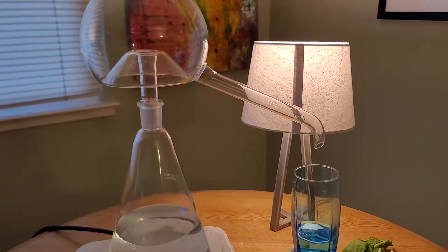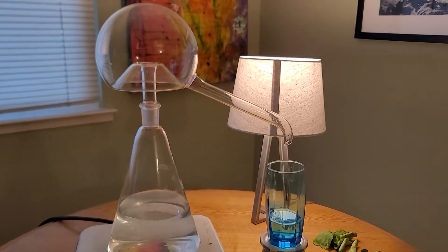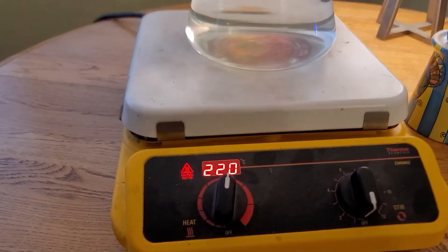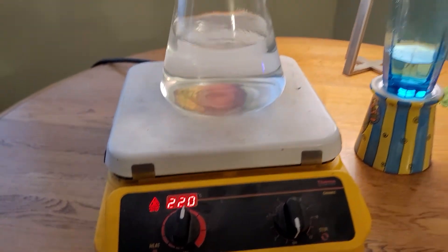Hello, this is Stephen School of the Stephen School Alchemy YouTube channel. I am distilling some water here at home. And normally lately, I've been using the temperature of 190 degrees Celsius to distill my water.